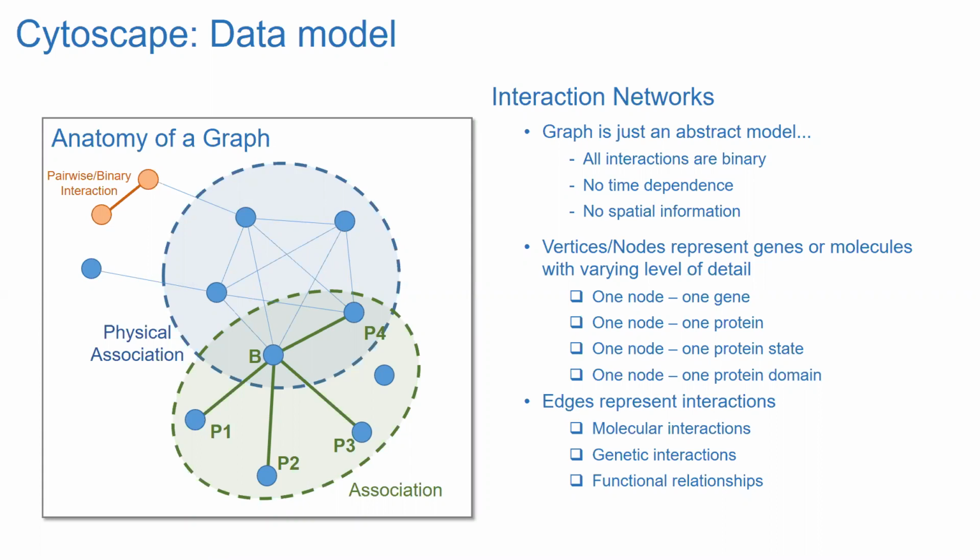Another class of experiments is where you've got one protein tagged to be purified by affinity on the affinity column, and then together with this protein you might have several co-purified together. This is going to be reported as co-IP or pull down or whatever, and you're going to have a bait protein purified with, let's say, 5 or 6 or whatever prey. Once more, the experiment is going to give you all of those, and then this list of proteins has got to be converted into pairs, because otherwise Cytoscape or any graph-based method is not gonna take them.